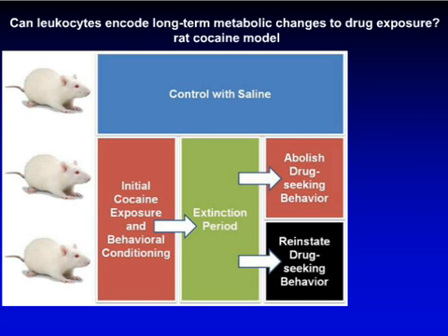So what I'll show you now are two very quick examples. One of the first studies we did is to establish a drug test for long-range drug use. Hair, saliva, and urine show you short-term drug use, like a few days ago. The question we were seeking to ask is, if someone used cocaine years ago, would we be able to tell from altered biochemistry in the leukocytes, or immune cells, that they have seen cocaine previously? So we established a rat model of cocaine abuse.